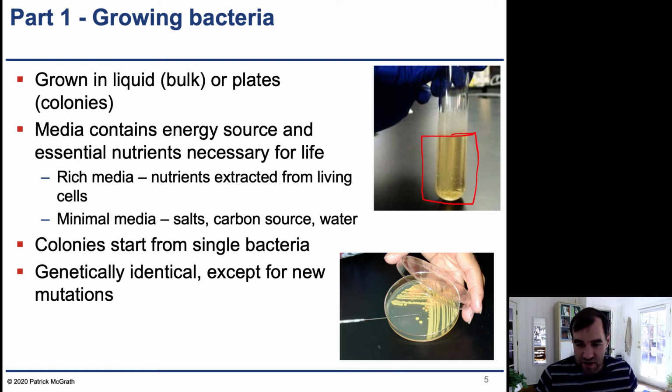This agar is kind of like a gel. It's derived from seaweed, but think of it kind of like hard Jello. It has that feeling of Jello, but it's much harder. And Jello is infused with food dyes and sugar, while this agar is actually infused with nutrients. So it's not just a hard, gel-type substrate; within it there are also all sorts of nutrients the bacteria can use.